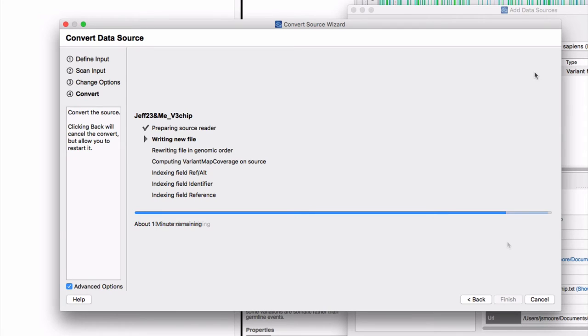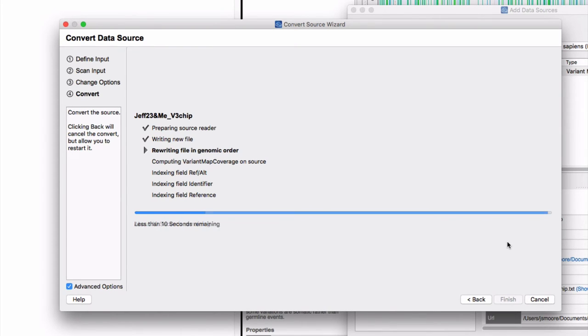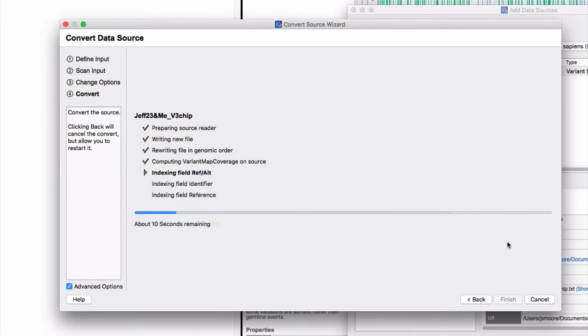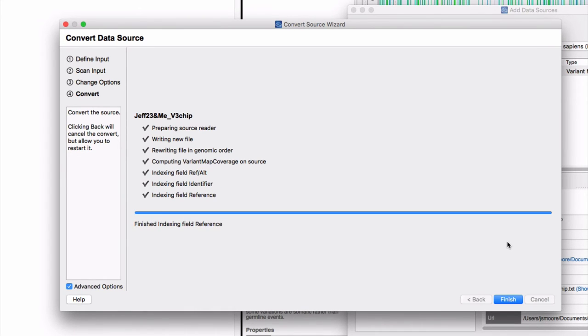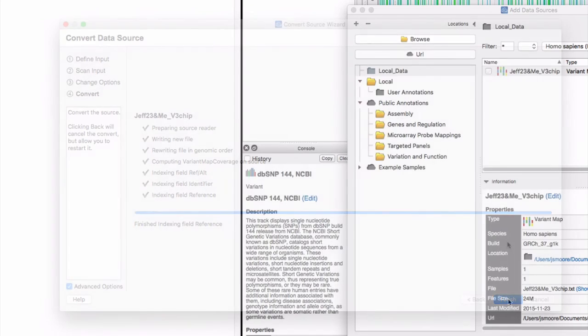After writing new file, the next steps are pretty fast. Once all the steps have finished, you will be able to see your data in Genome Browse. Click Finish.